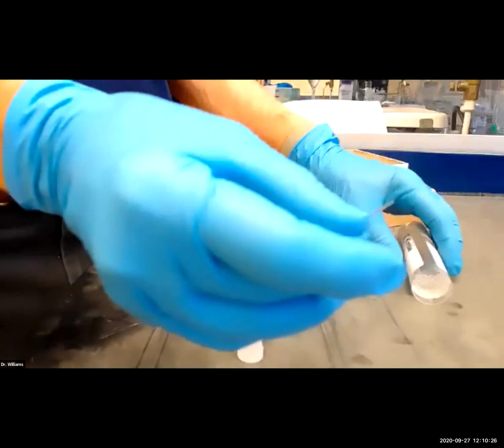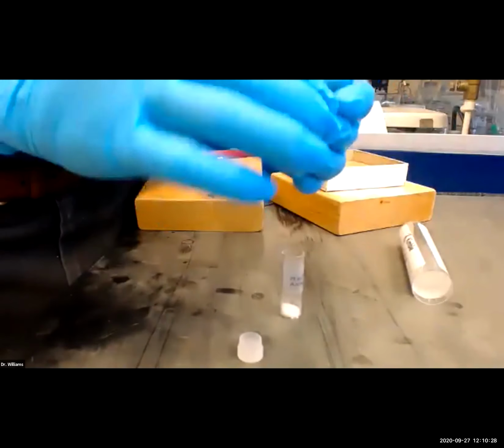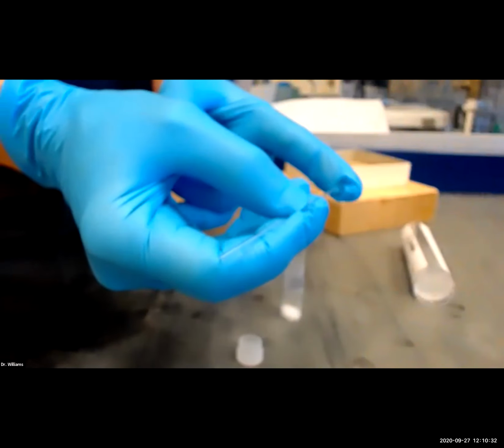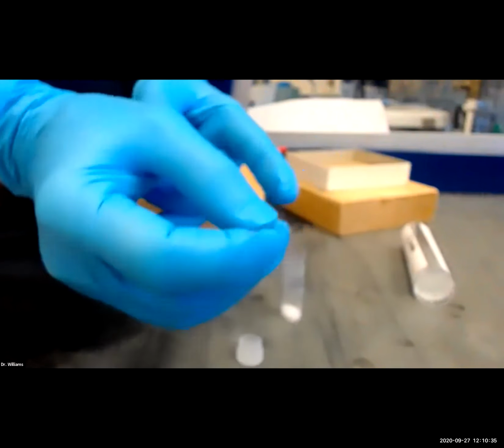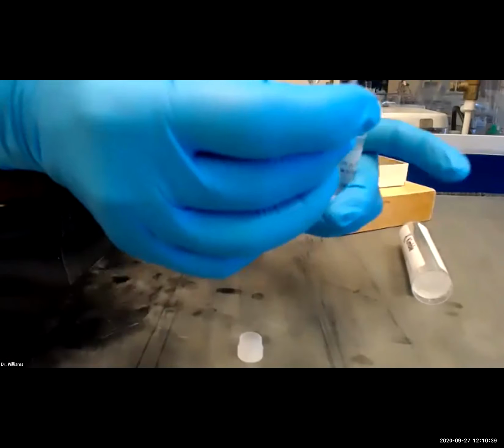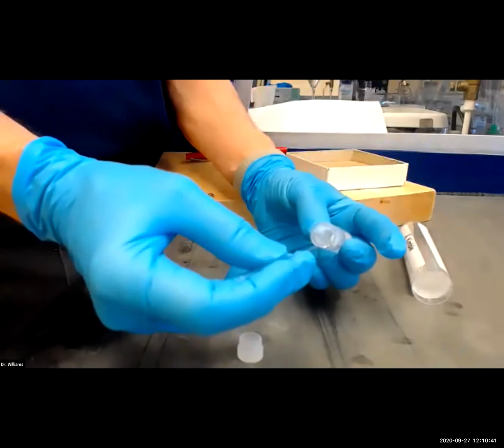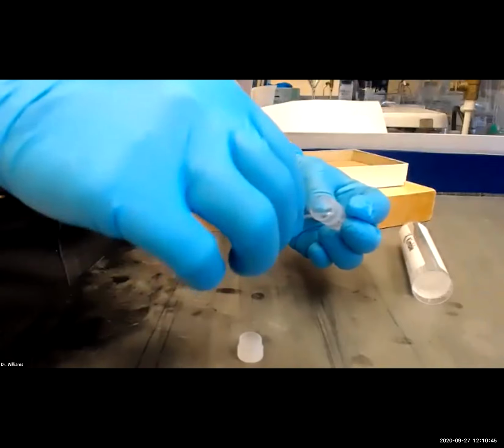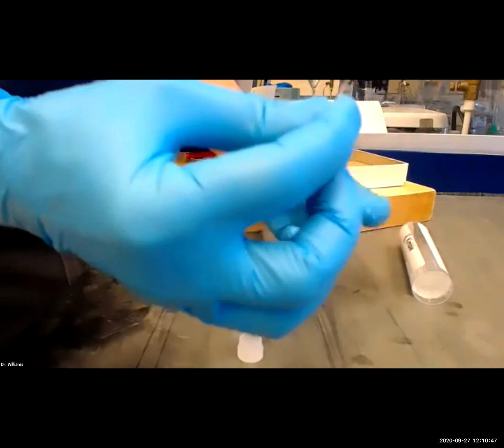Melting point tubes look something like this. I'm sure you heard the sound in the background there, which tells you can insert the sample. So there's a melting point tube. Check to make sure it's sealed on one end and open on the other end. So the open end obviously goes into the sample. You only need 3 or 4 millimeters of sample.